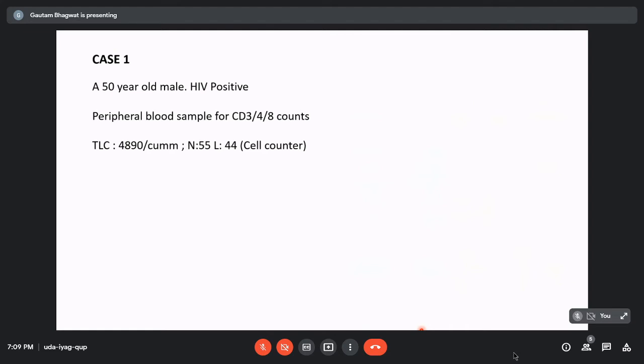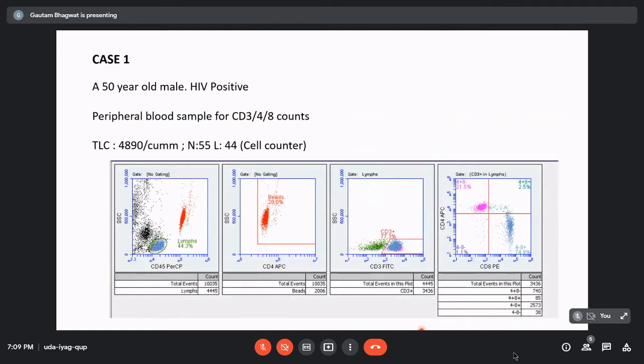So if you see, the lymphocytes are normal count-wise, but let us look at what the subsets tell us. Now these plots are from a clinical software which gives us the counts. So here I would like to emphasize two important points. One is, whenever we want absolute counts from a flow cytometer, we use these fluorescent labeled beads in the tube. These beads are nothing but polystyrene balls, fluorescent labeled, and have a very bright intensity to one of the fluorescent markers in the tube.